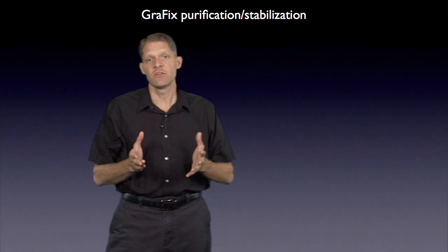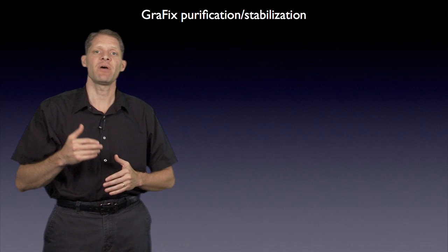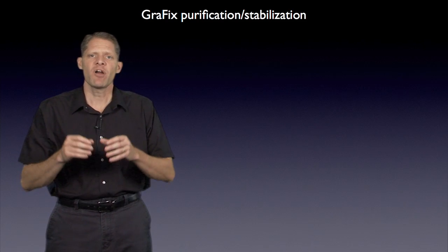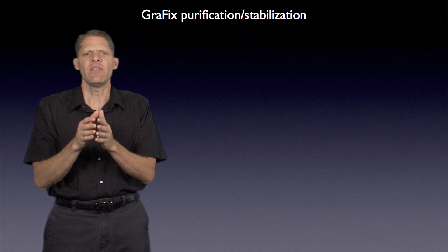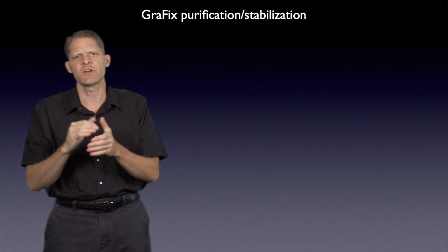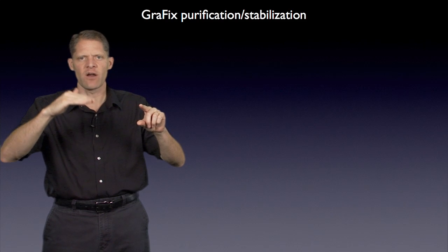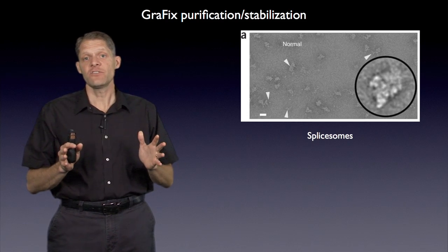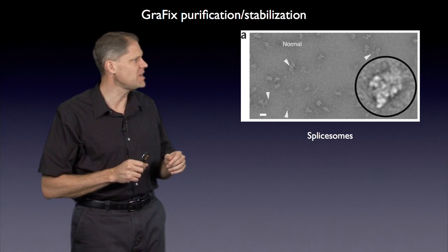Now, as we mentioned, one of the challenges in single particle analysis sample prep can be that particles have a large number of different conformations, and they can also be unstable once they're concentrated and spread into a thin film next to an air-water interface. And so in some cases, the particle images don't look crisp and homogeneous.